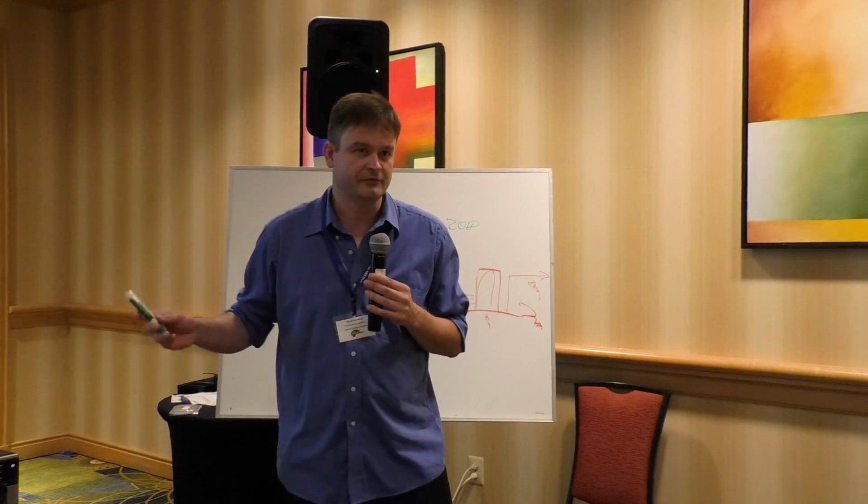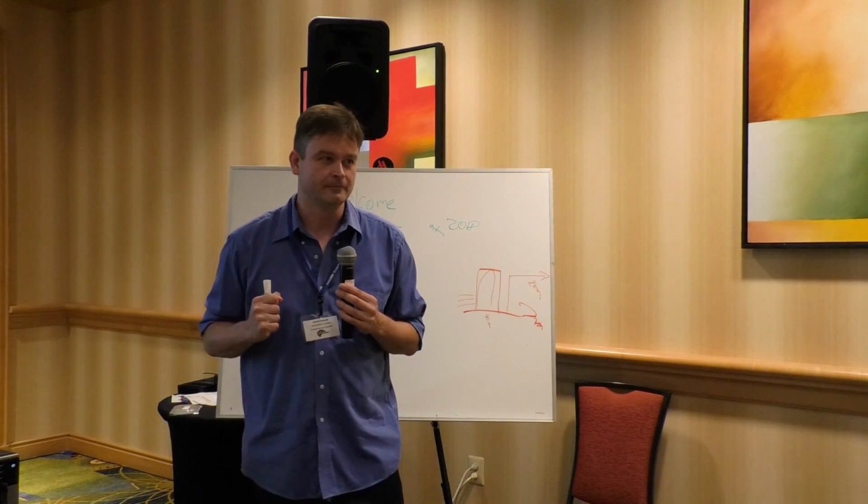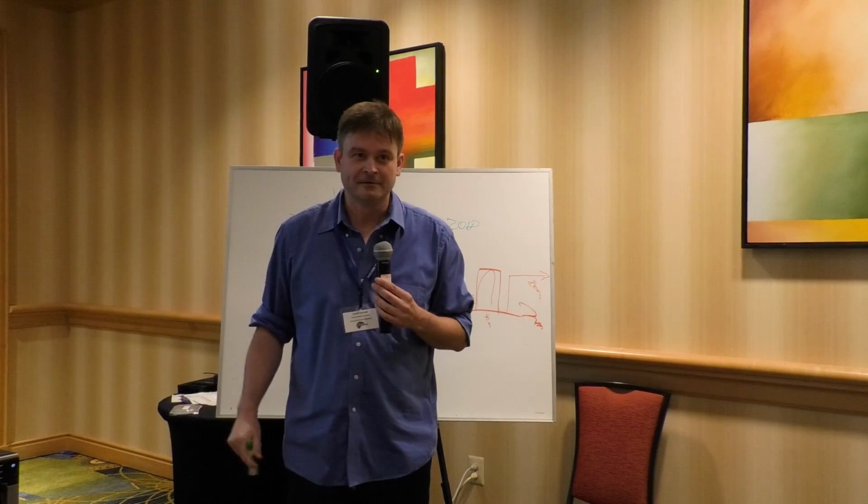We're pretty sure that this is a variant of something that Warren Zipfel and Ted Young built in the past. So this is not completely new. 50 years ago, somebody had the idea of putting in a calibrated light source. 20 years ago, somebody had the idea of putting in a calibrated light source. Here we are again and say, put in a calibrated light source. The question is, how hard is it to do? But I mean, how hard can it be?